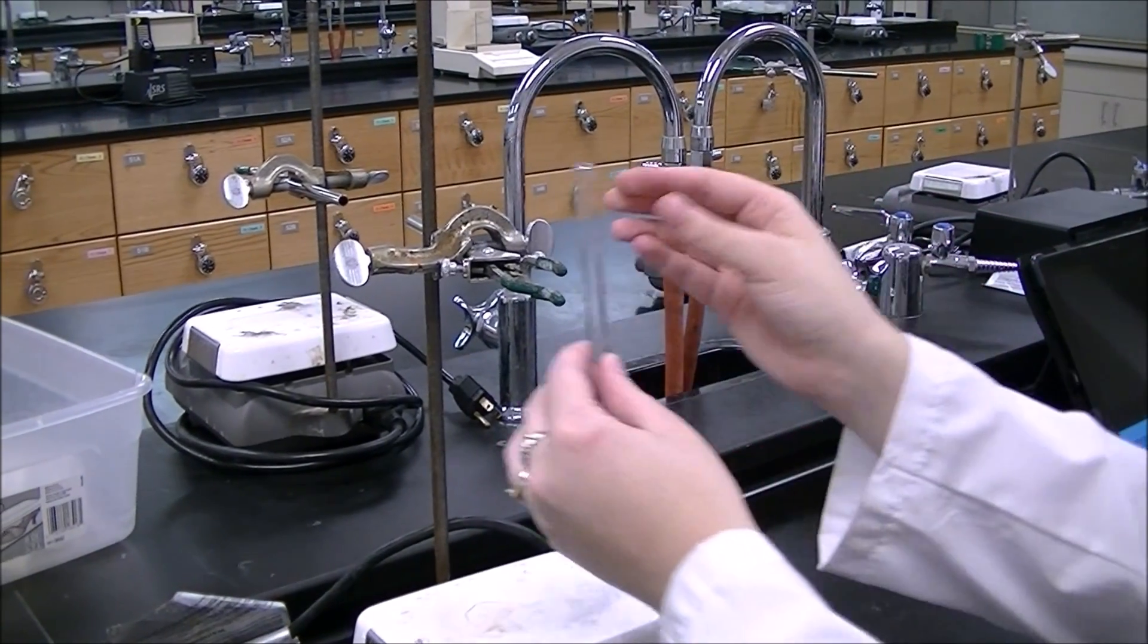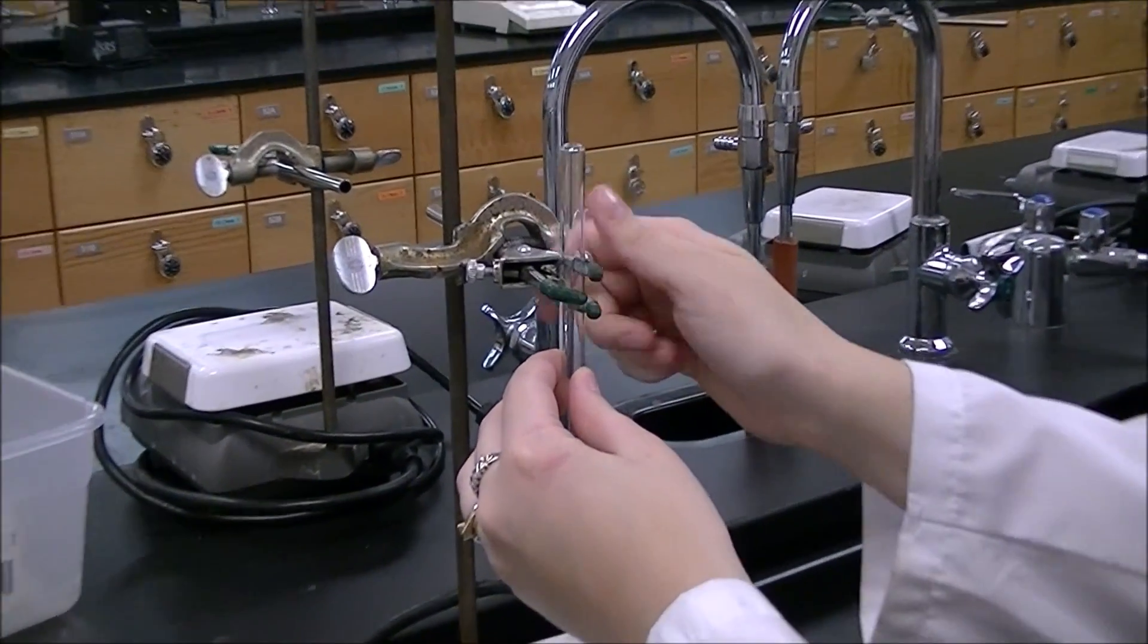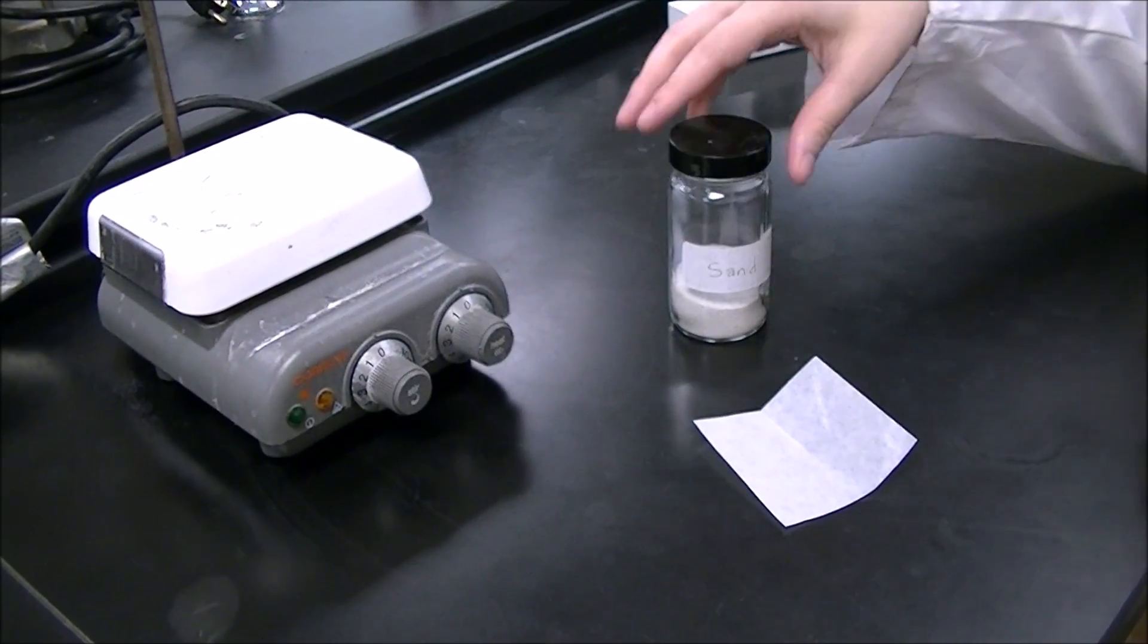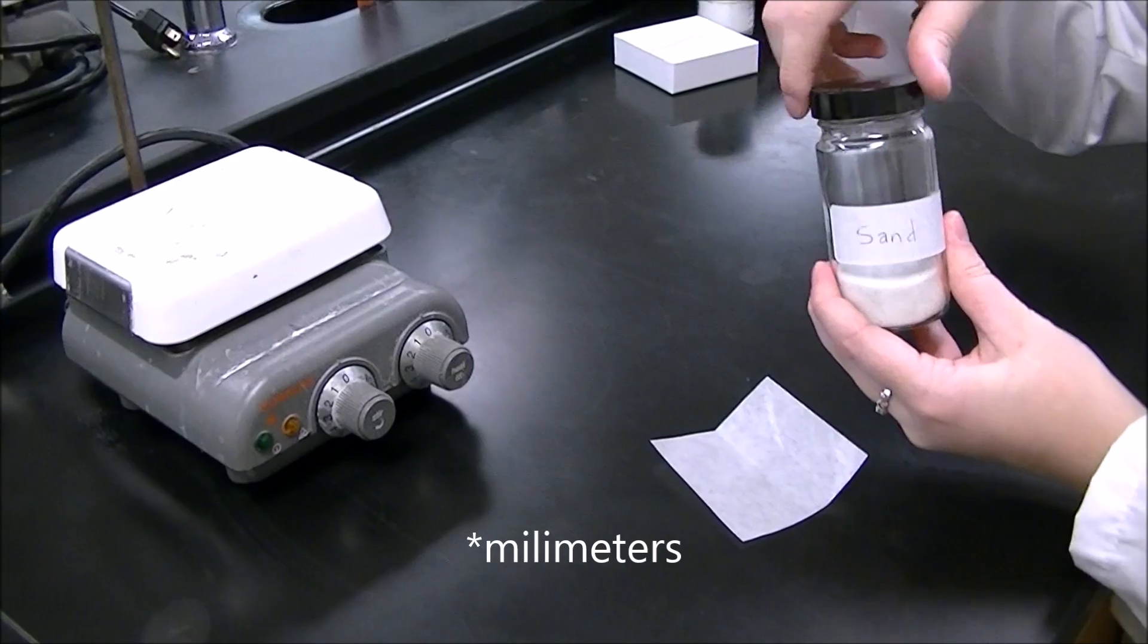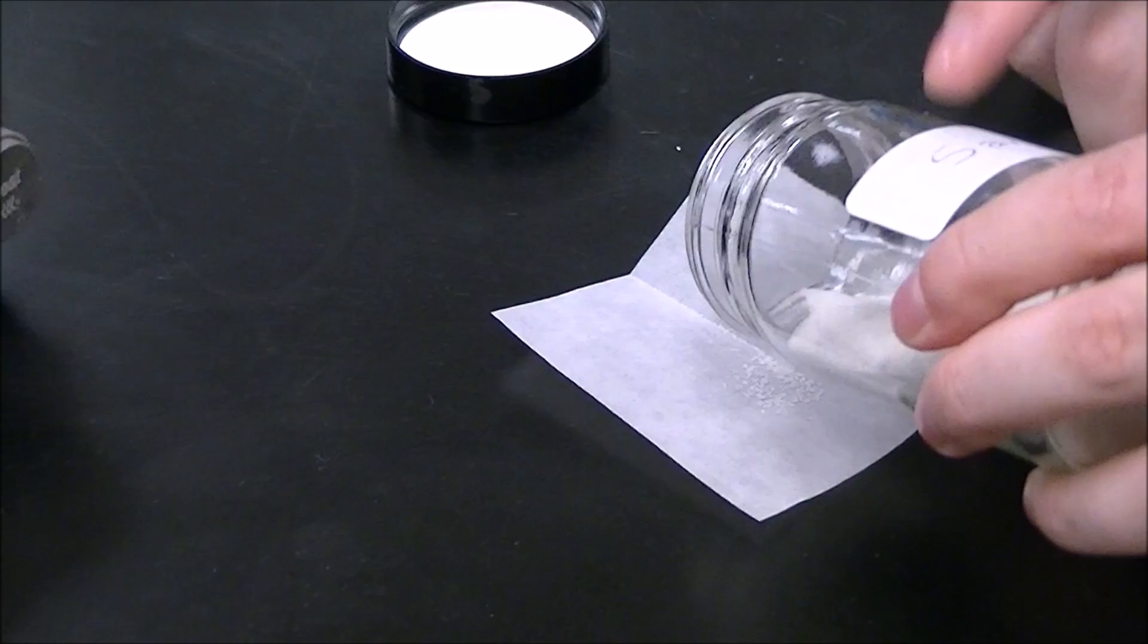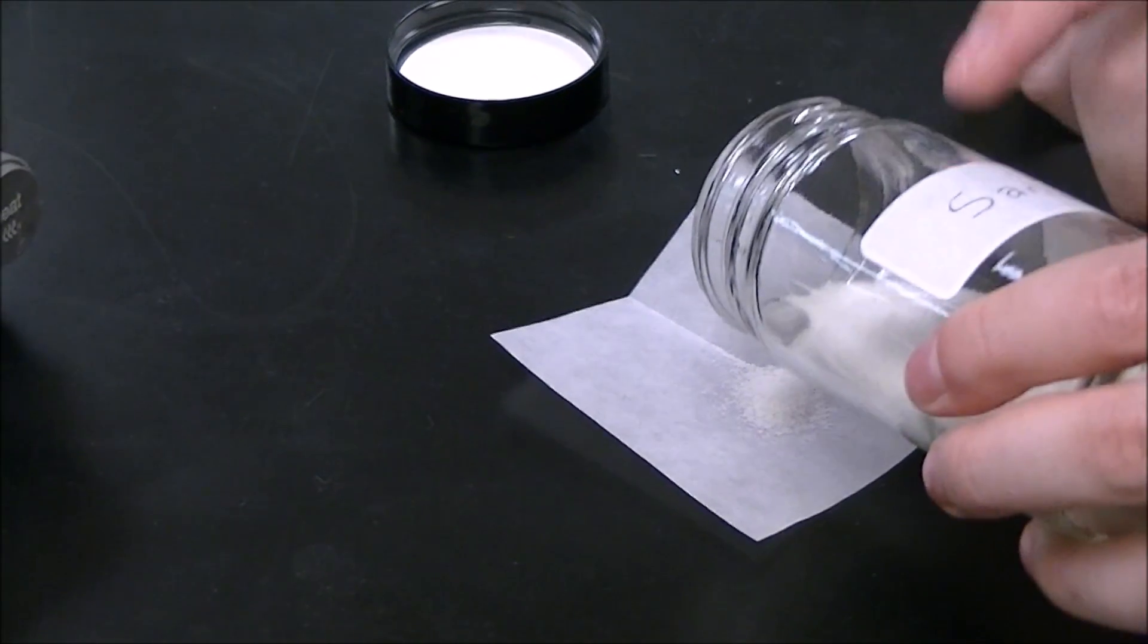Now attach the column to the stand. Now we're going to add about 2 milliliters of sand to the bottom of our column. You can get it in there by using this wax paper as kind of a funnel.